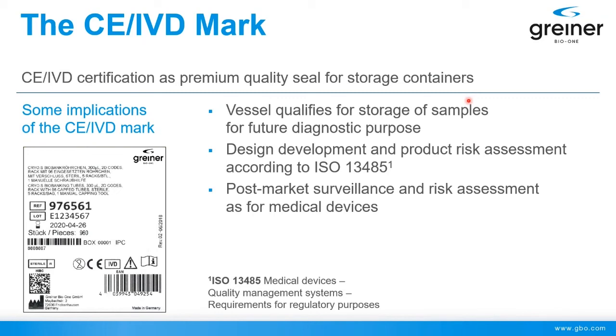And there's also a lot of discussion going on about how the regulation around biobanking will look in the future. Because what you often base on your samples is pretty much a diagnosis, or you develop a diagnostic tool. And in the future we believe these processes will also fall into this context.